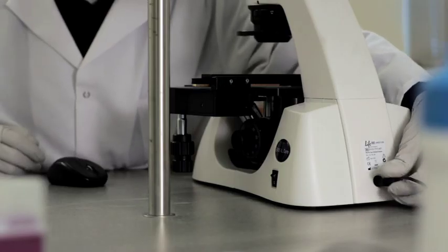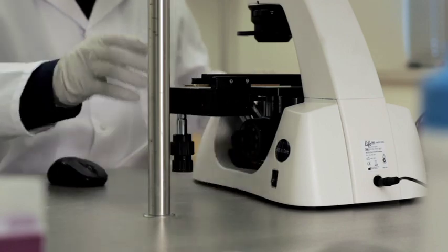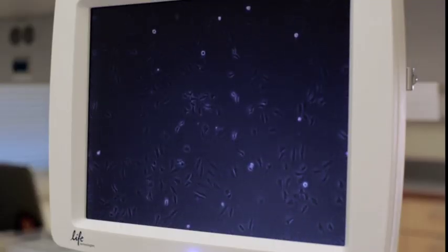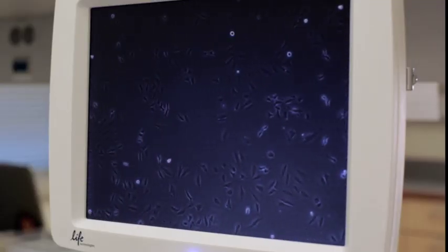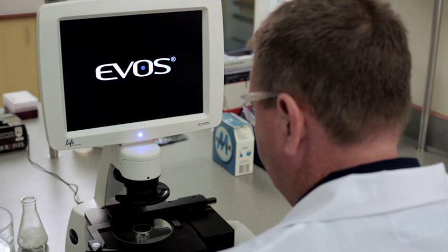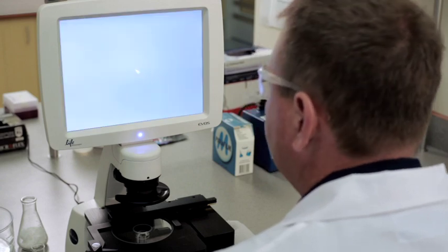Simply plug in the instrument, turn it on and you're ready to concentrate on what's important: imaging your cells. The EVOS XL Core imaging system takes less than two minutes to unpack and set up.